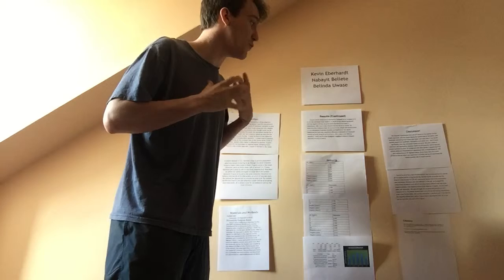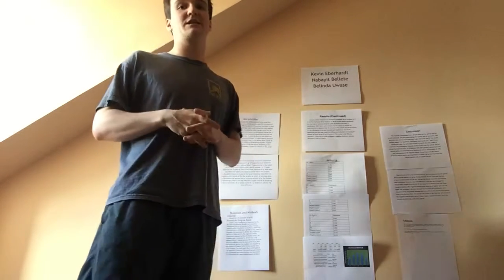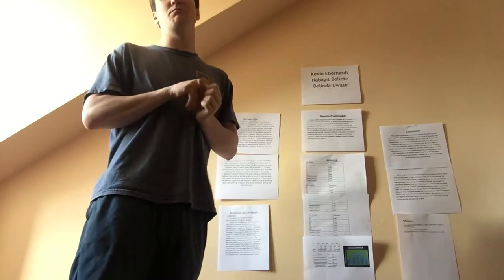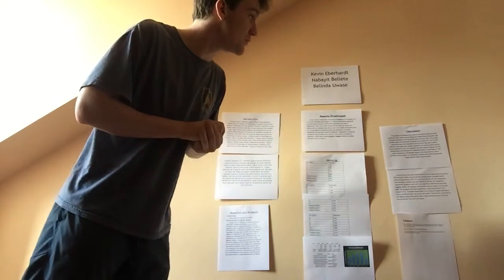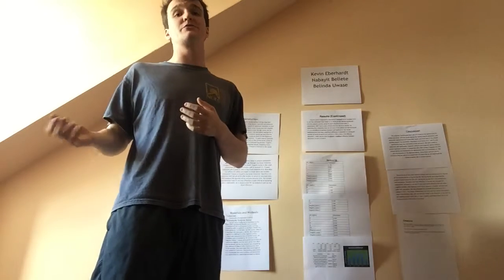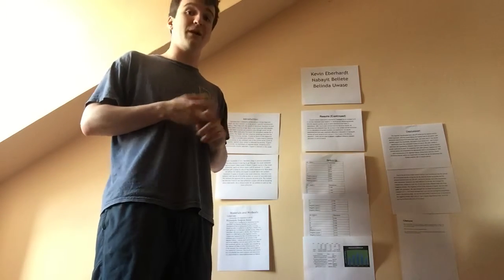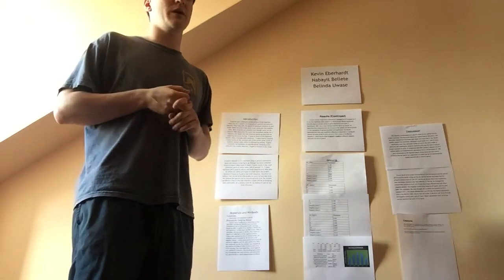Now, in terms of whether this was the highest possible rate of enzyme activity, we believe that it was because we used a salinity of 0.15 molar sodium chloride, and we also incubated at 50 degrees Celsius. And from our comparison with other groups, these appear to be the optimal temperature and the optimal salinity for this reaction to occur.